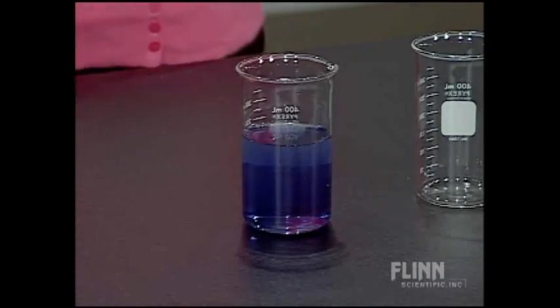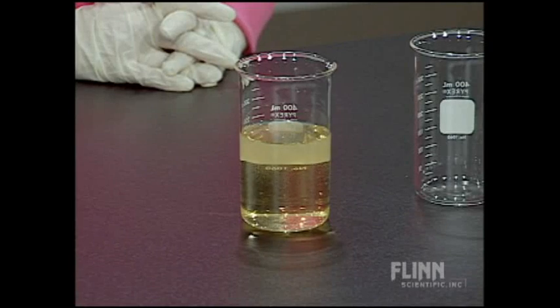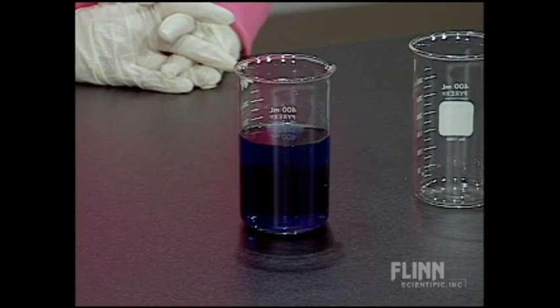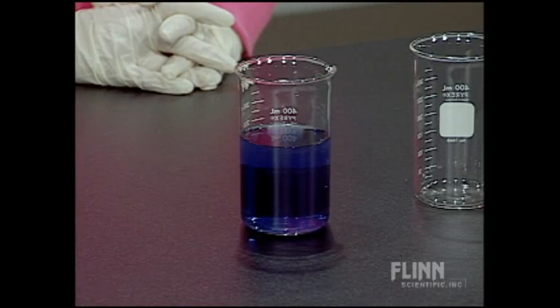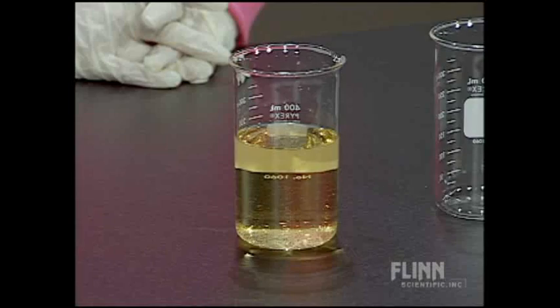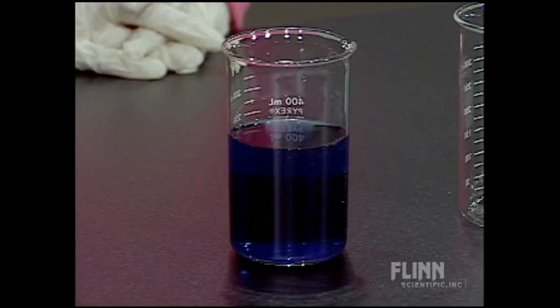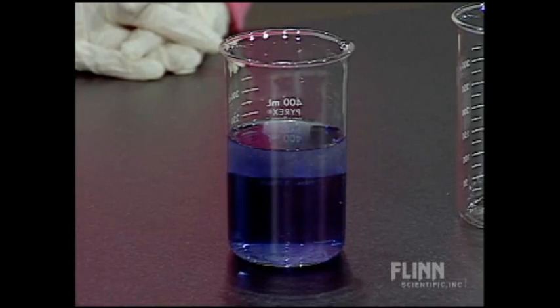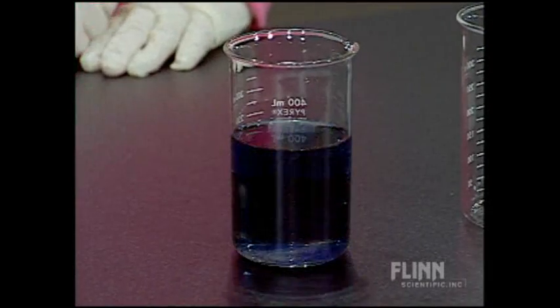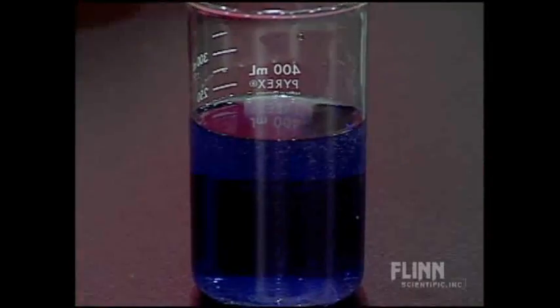But what's going to happen next is it's turning colorless again. And then it's turning yellow again, and then it's turning blue again, and we'll keep watching it. It's back to colorless. Wait a minute, what is going on here? When I said that this is chemistry that has the power to surprise, this is unexpected. Usually when you do a chemical reaction, you have reactants, you go to products. You're done. In this case, though, it seems like we're going back and forth.